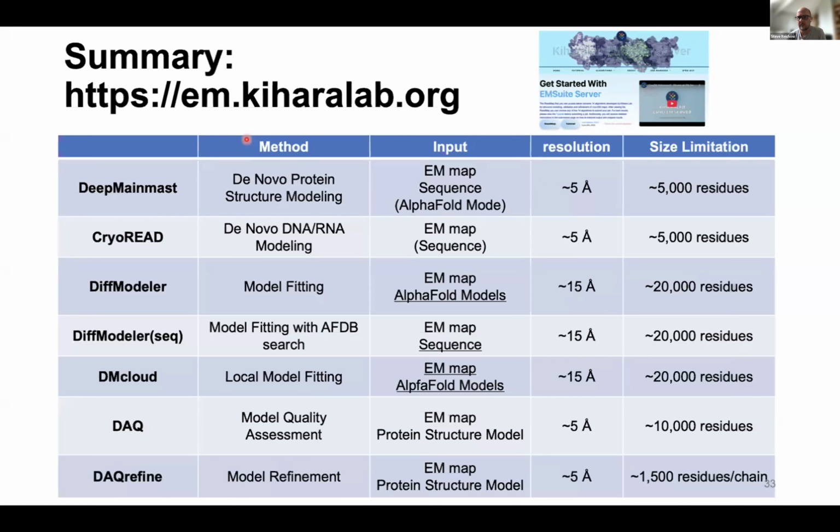Great. But I guess Genki, in terms of size limitation or quality of the model, is there any difference between the server and the standalone program? Basically, no. I think it should be the same. But I noticed that there was one question on the question-answer page about the difference between the CryoREAD server and the standalone program. I'm not sure why it happened. I encourage them to contact me, and we will check what happened.